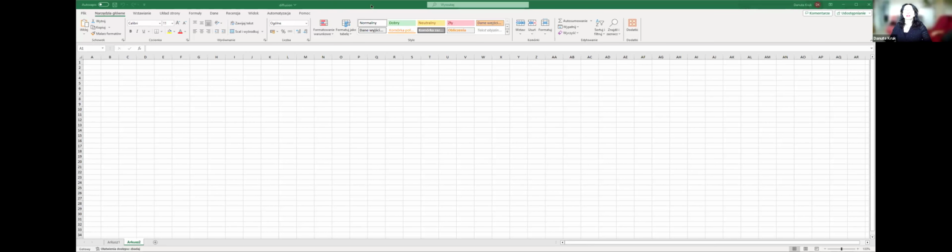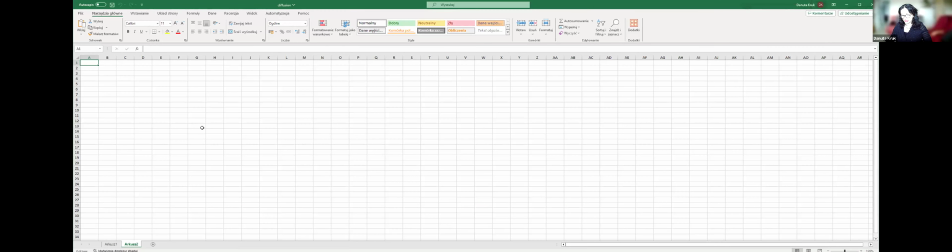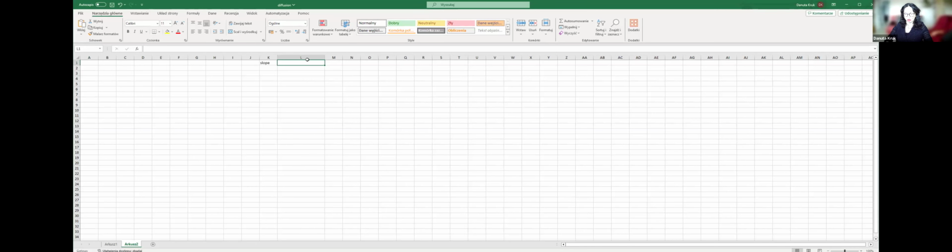I am back with you. Yeah, what I have here is after all nothing else than a simple Excel sheet. And let me start dealing with the diffusion coefficient. So I have the slope, it is 0.507.